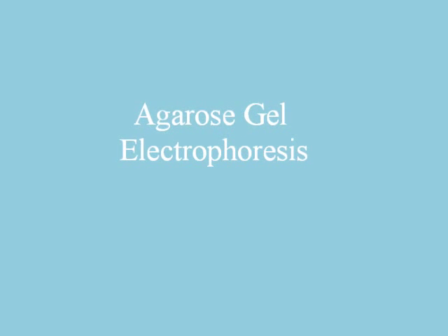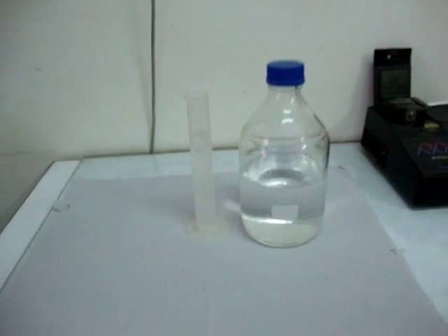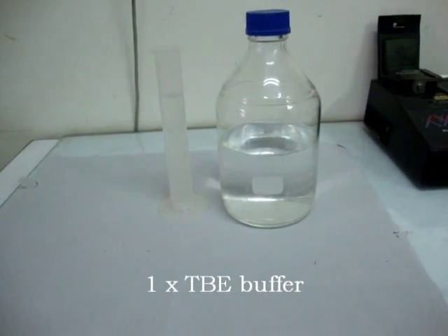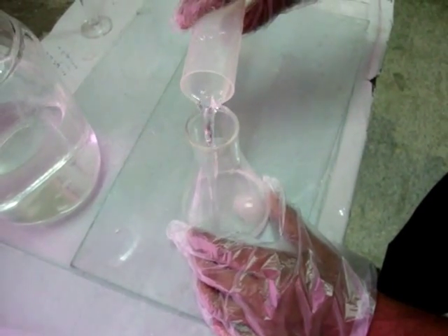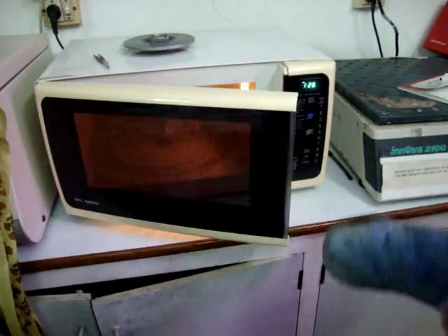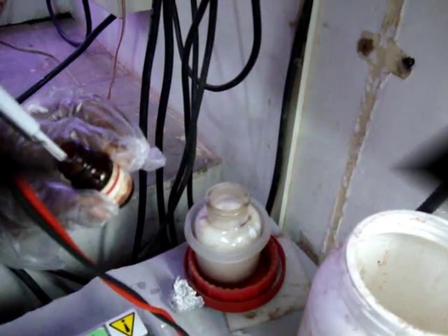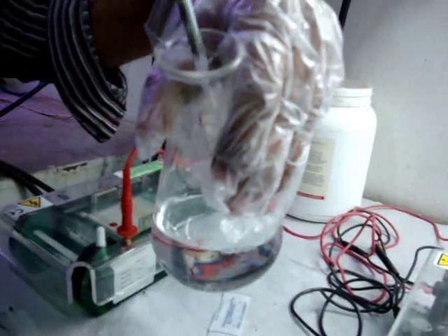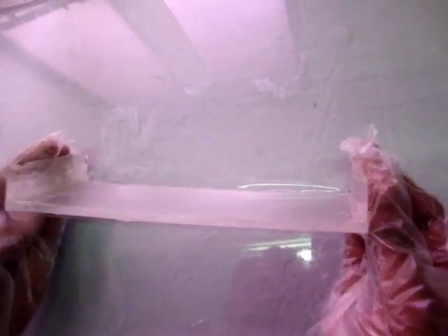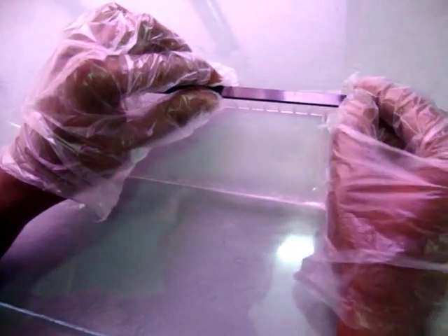The next step is agarose gel electrophoresis. 3g agarose is mixed with 1X TBE buffer for preparing 3% agarose gel. The solution is heated in a microwave oven for 3 minutes to get an agarose gel suspension. Ethidium bromide is used as a staining agent at a final concentration of 1 microgram per ml. The open ends of the gel-casting plate are sealed with cello-tape and the comb is properly placed in the gel-casting tray.